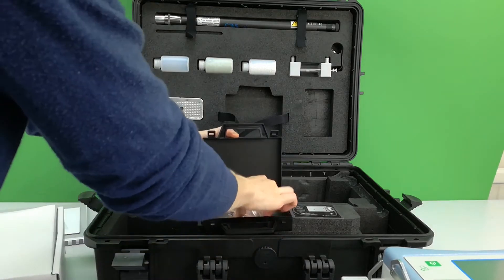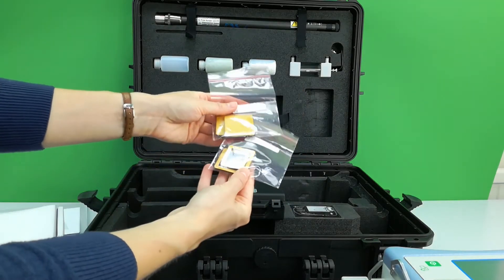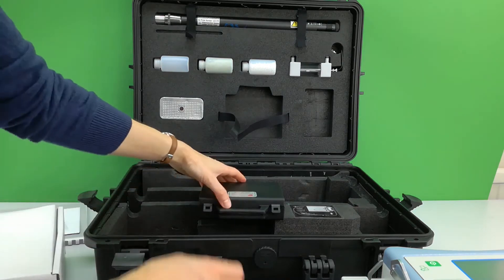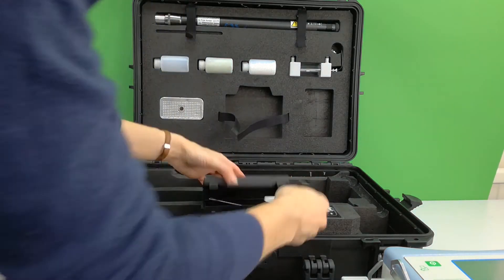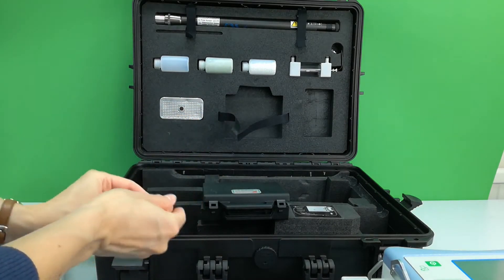An integral thermistor is supplied within the chamber and this is the default setting. A spare set of foam gaskets are supplied, along with a jaw adjustment tool for changing between different chambers, with three simple screws.